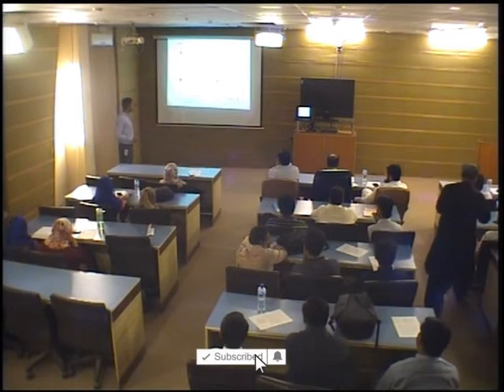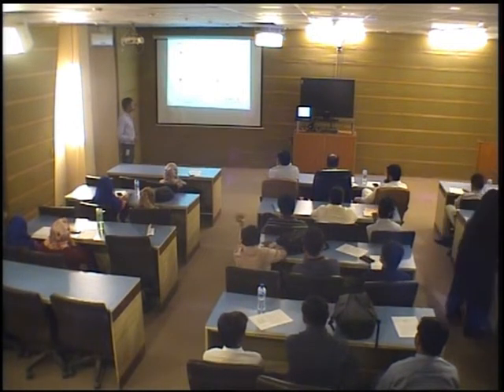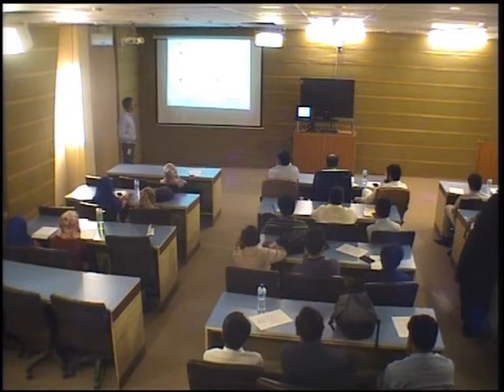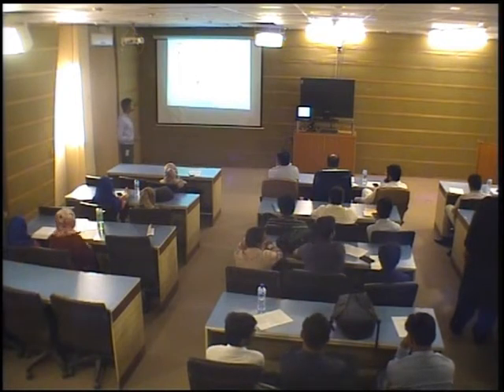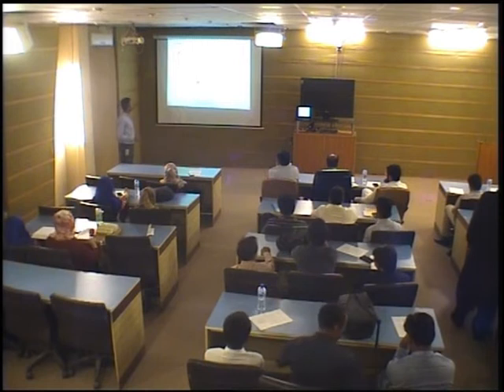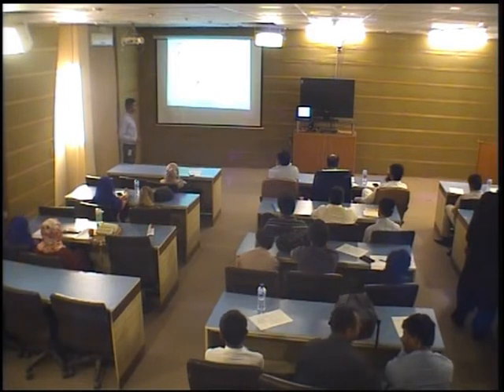In figure H, it starts from 504 to 528. We have observed titanium, copper, mercury, lead, chromium, calcium lines. In figure I, we have observed calcium, barium, sodium lines. In figure J, we have observed calcium, barium and remaining calcium lines. In figure K, we have observed barium, lithium and calcium.